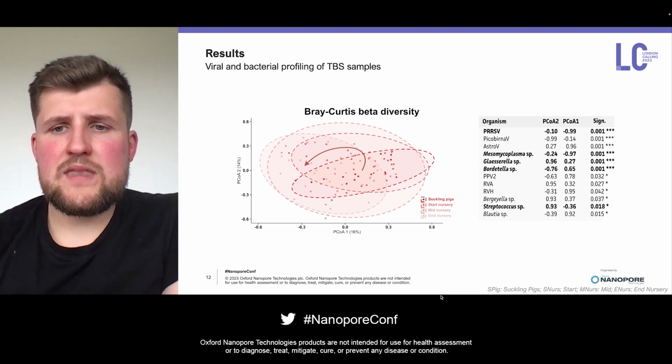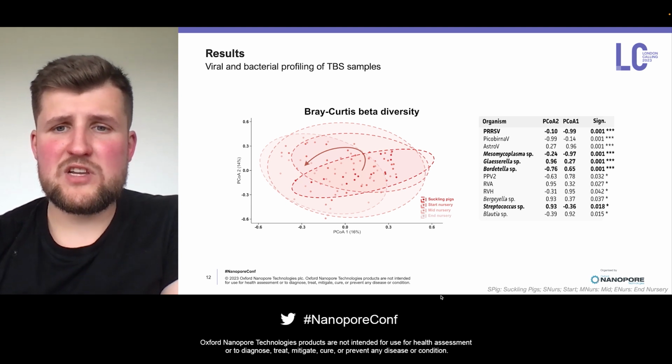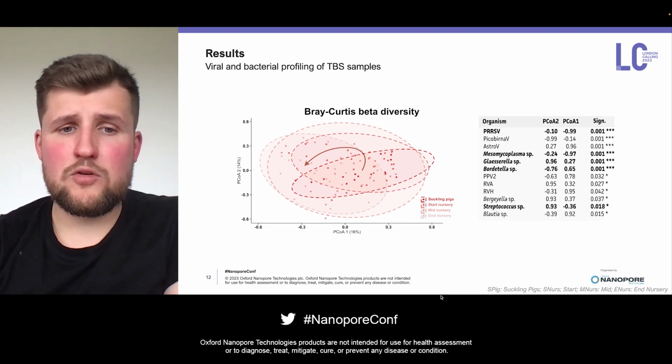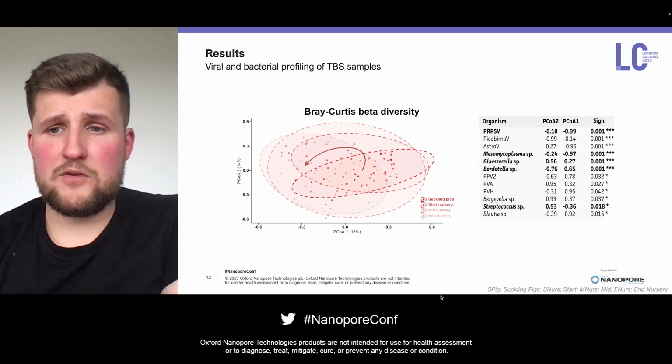We can perform in-depth statistical analysis to compare and look at the beta diversities within these samples. It allows us to actually look at the significant contributors. In this case, we look at age, but we can also do that for the influenza status. We can do that for the health assessment, sneezing, coughing, or any other parameter you're interested in.